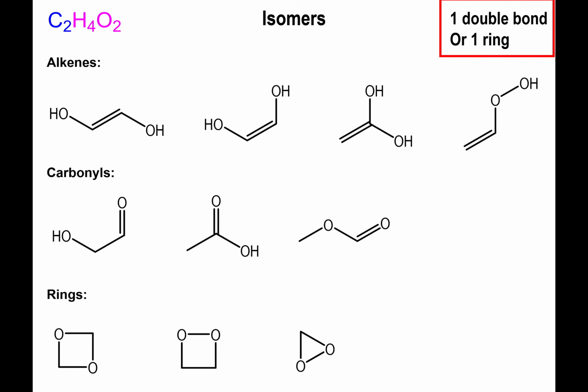But we could also be dealing with a 3-member ring. You could have your oxygen within it, right? So oxygen bonded to 1 carbon, which means that the second carbon will have to stick out from the 3-member ring. Or alternatively, we could have 2 carbons on the 3-member ring, only 1 oxygen, in which case we'll have to have the second oxygen sticking out of the 3-member ring.